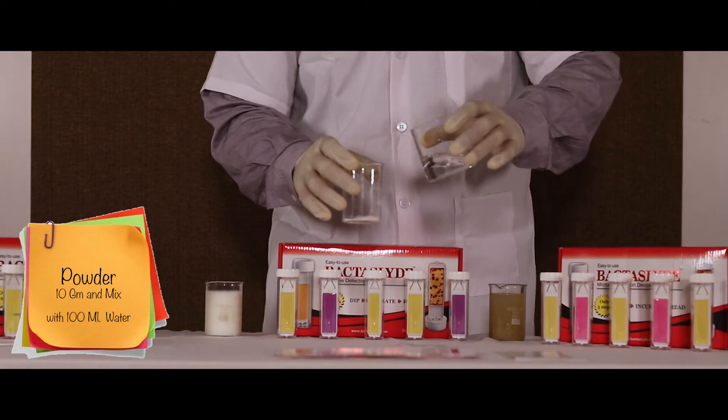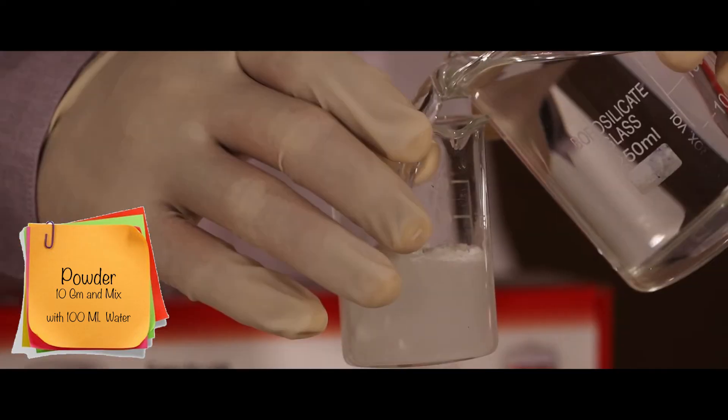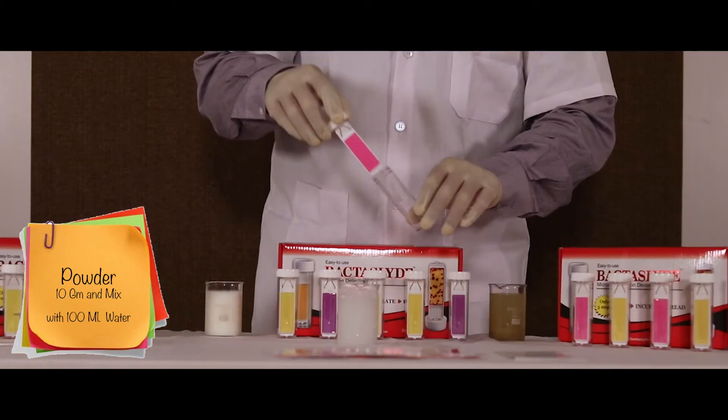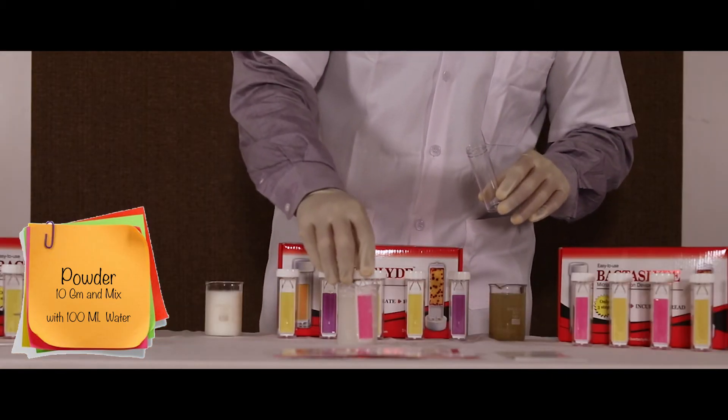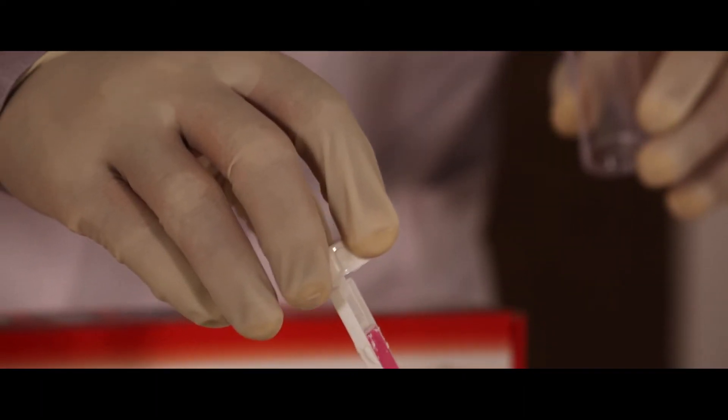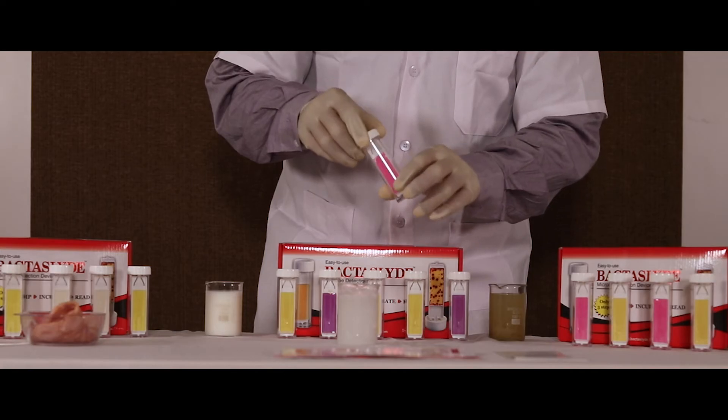For powder, take 10 grams of powder and dilute using 100 ml of sterilized water. Place the slide in it for 30 seconds. Gently shake off the excess and then screw the slide back in the tube.